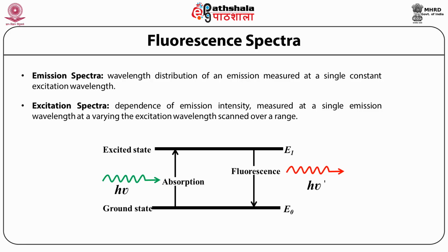The fluorophore remains in the lowest vibrational level of the excited electronic state for a period of about nanoseconds, generally termed the fluorescence lifetime, and then comes back to its ground state with the emission of a photon of longer wavelength than the incident light.